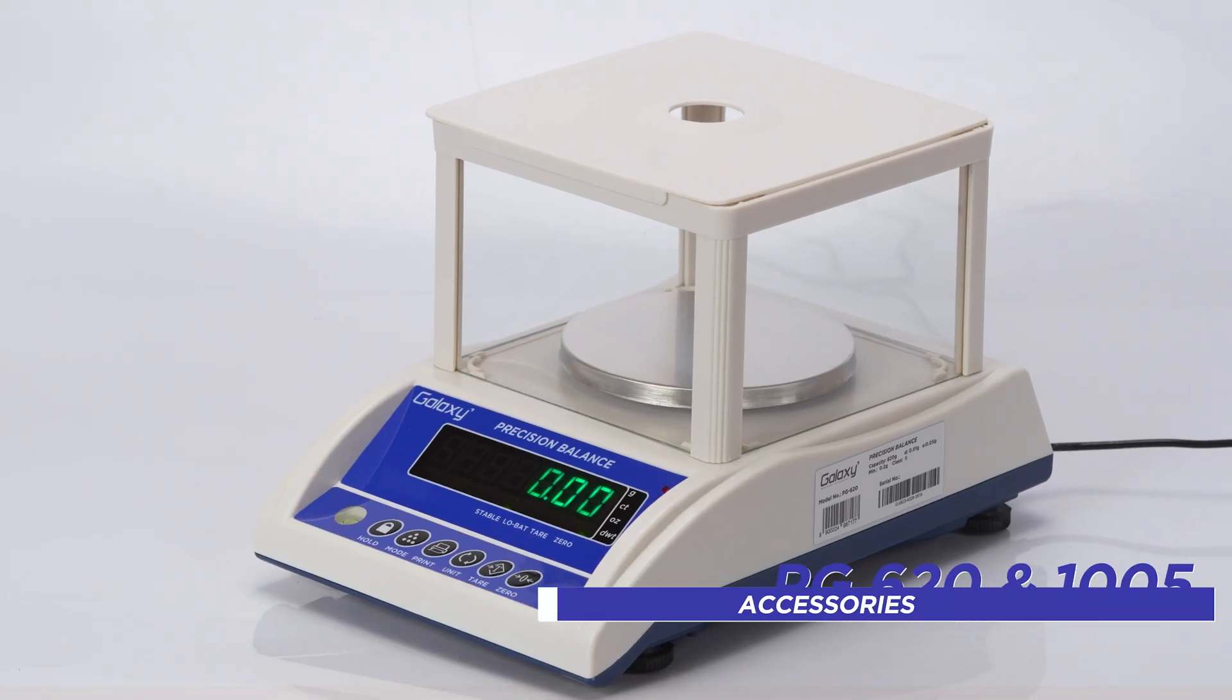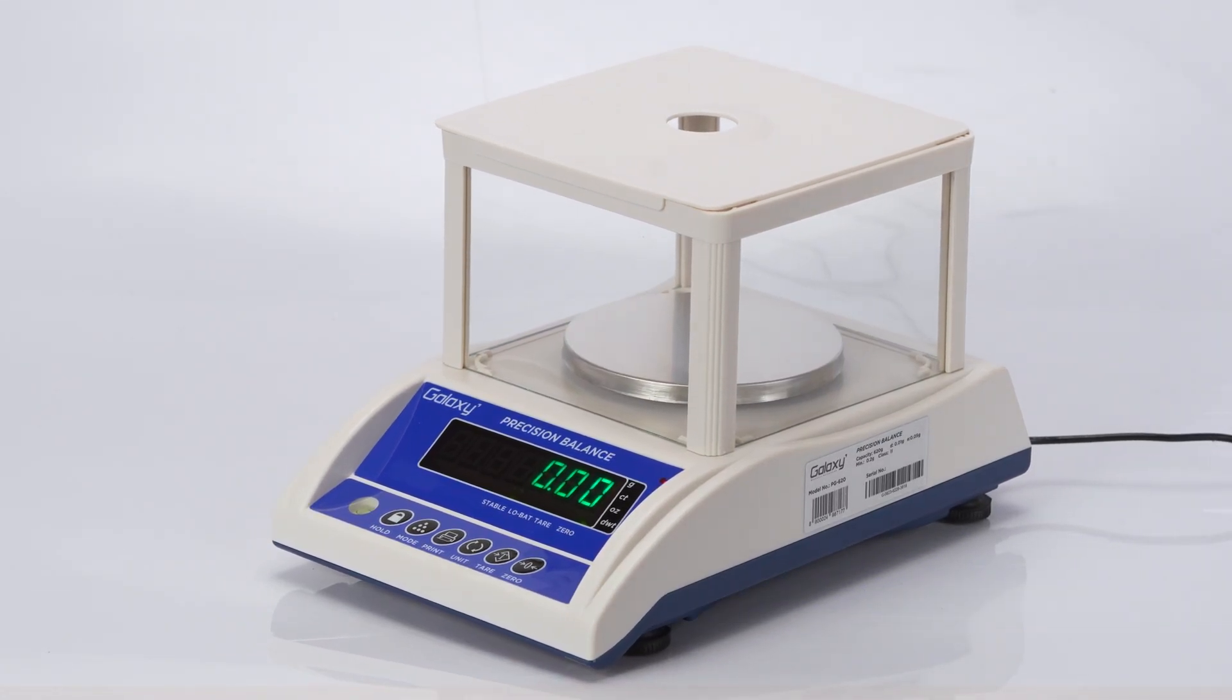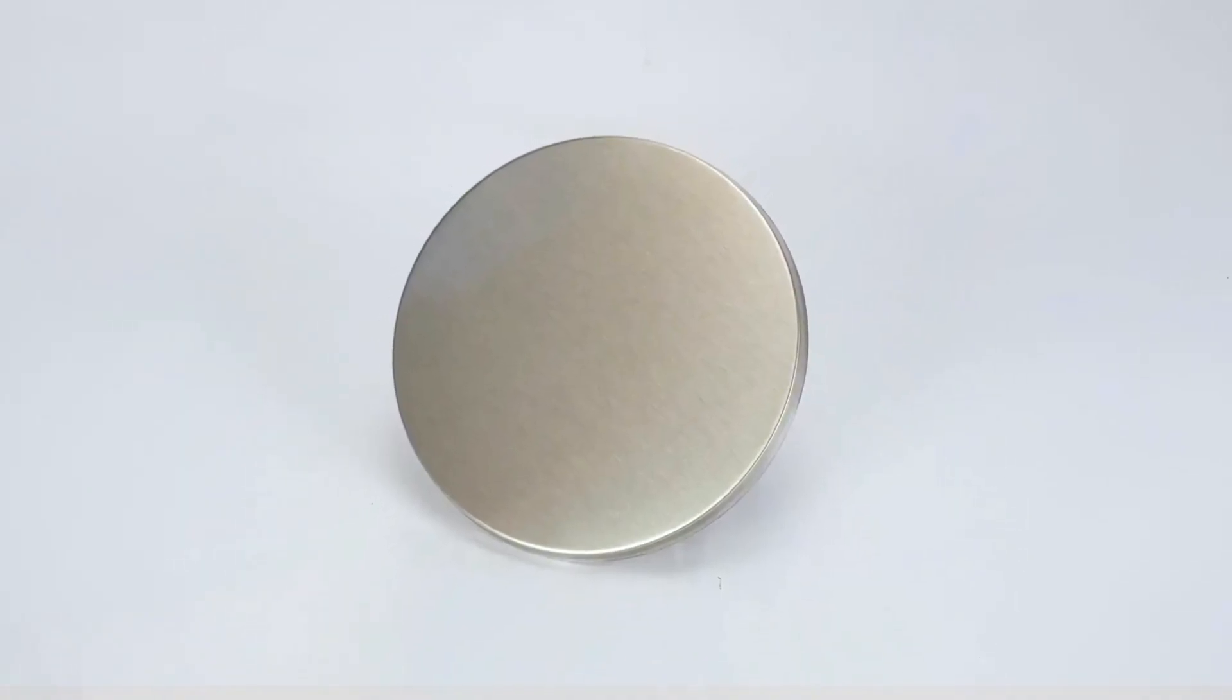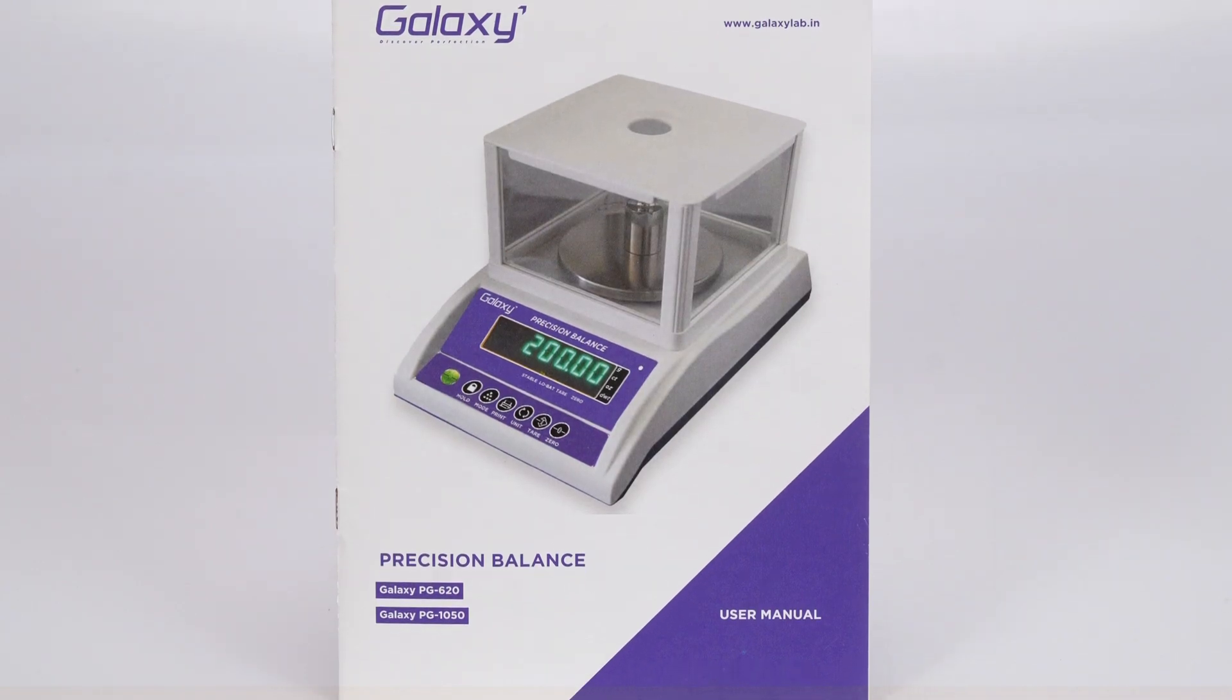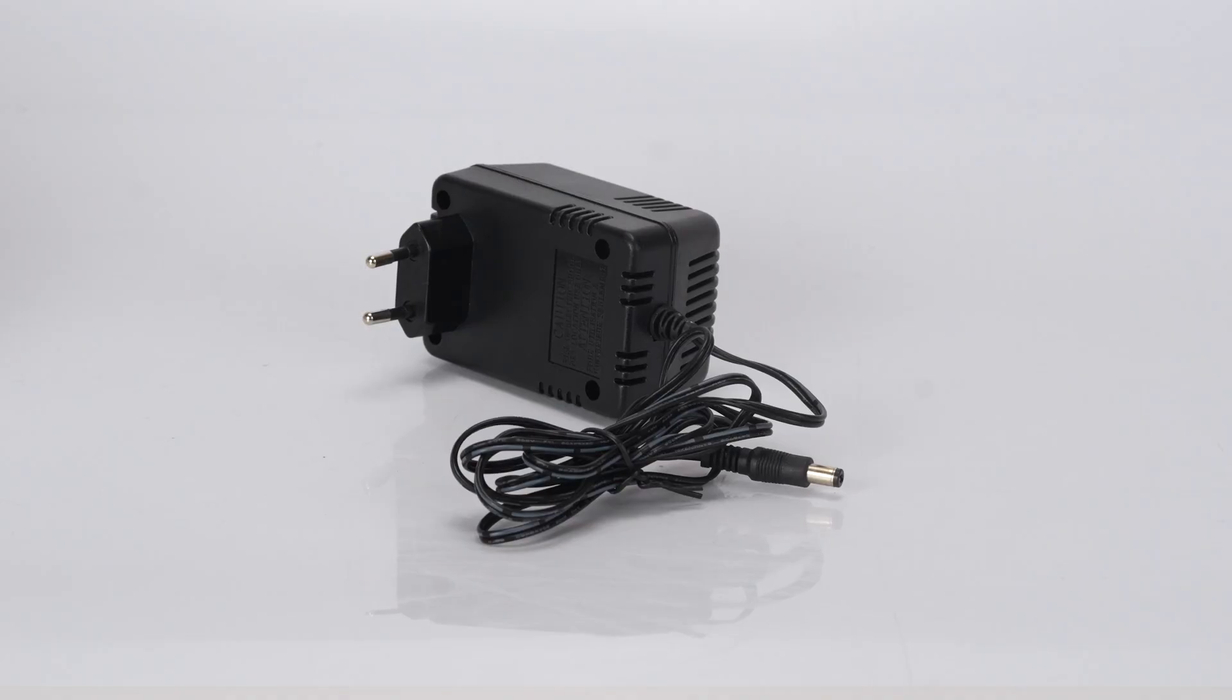The balance package includes the main unit, weighing pan, instruction manual, windshield and power adapter.